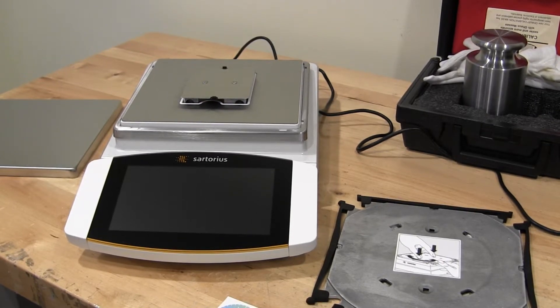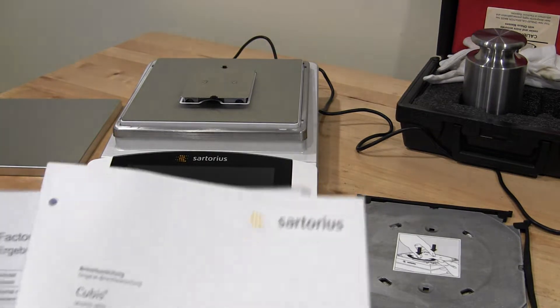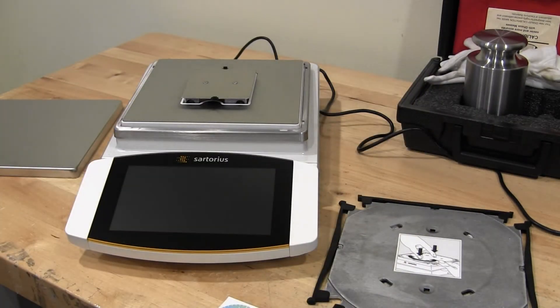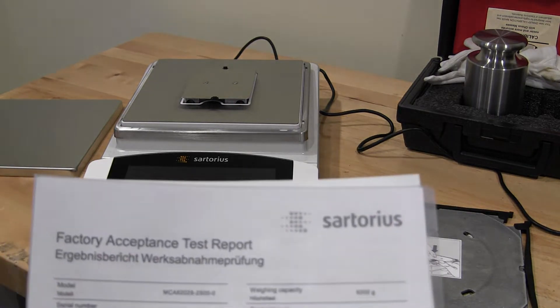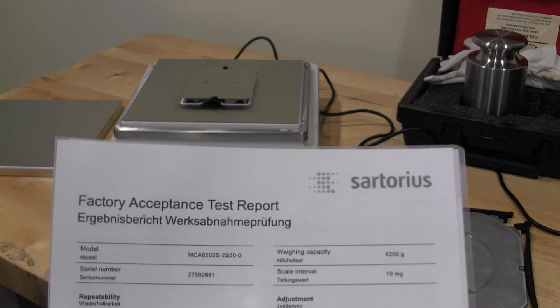I got my hands on a Sartorius Cubis II balance and just wanted to give you a general overview of this. The balance comes with a detailed manual, and this particular model is the MCA6202.